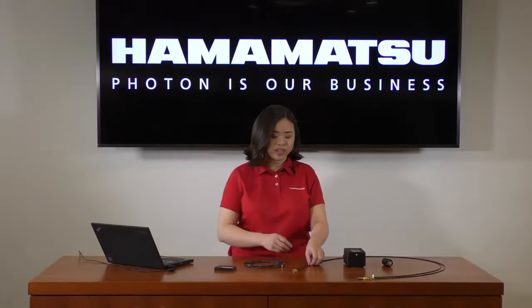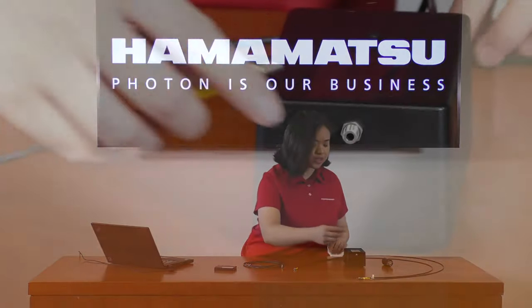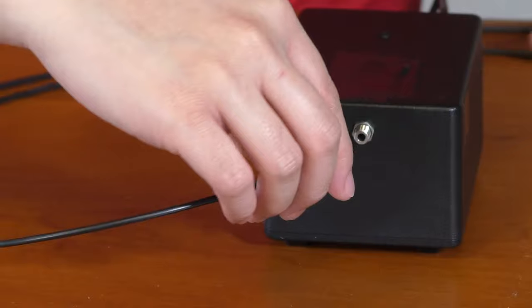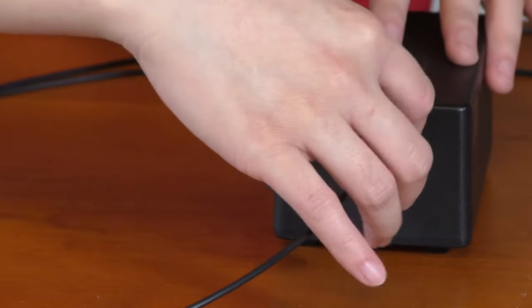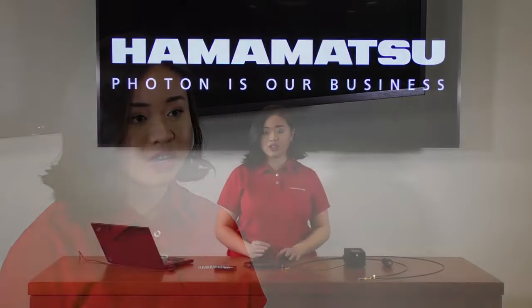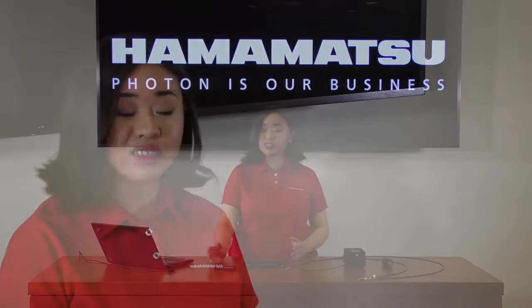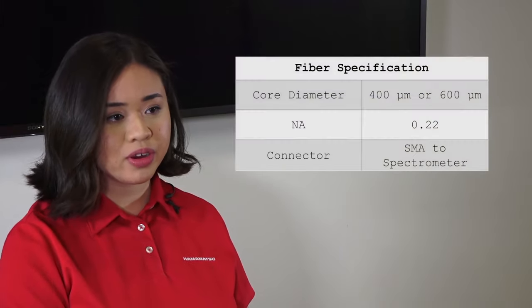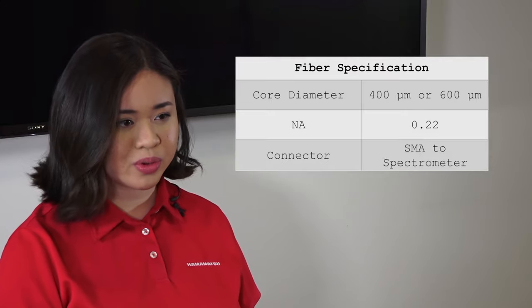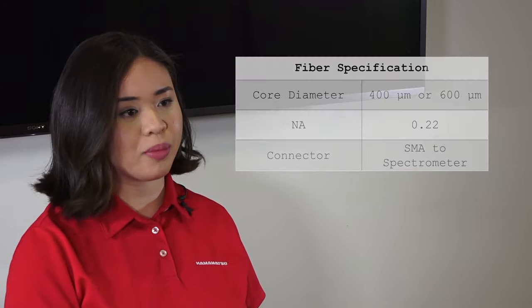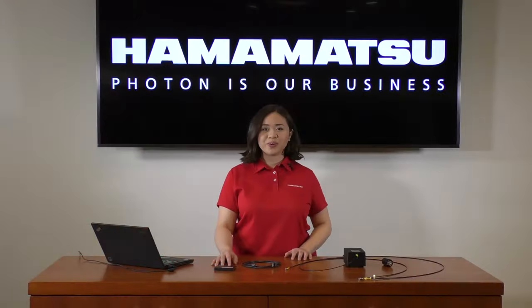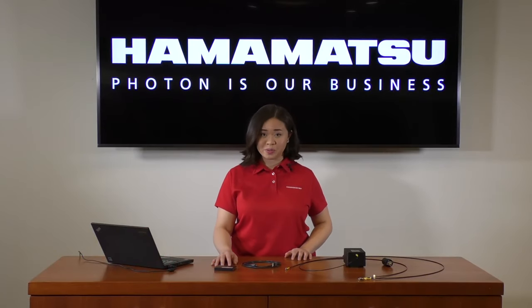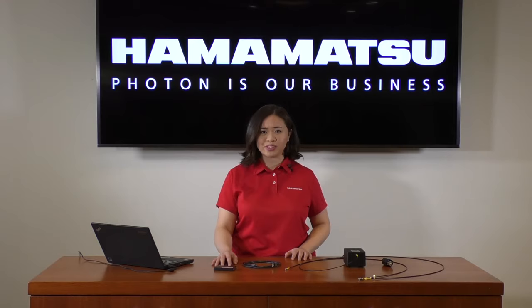Today we're using a broadband halogen source. Taking the SMA connector on one of our fiber optic cables, screw it into the corresponding SMA connector on your light source. In each spectrometer data sheet, we provide specifications on suitable optical fibers. For this spectrometer, we recommend using either a 400 or a 600 micron core diameter fiber with a numerical aperture of 0.22 and SMA connection to the spectrometer. It's important to make sure that the fiber you use matches these specifications to optimize throughput.